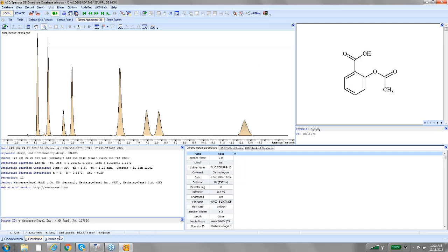The software does come with about 10,000 separations. These are a bunch of different types of separations across a couple of different chromatographic techniques.